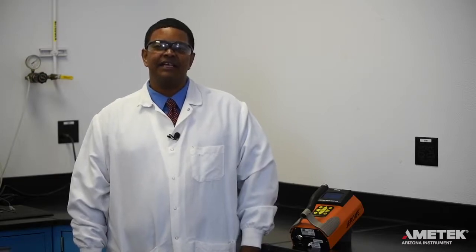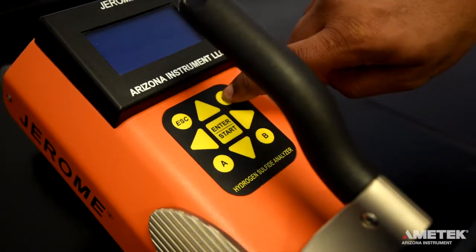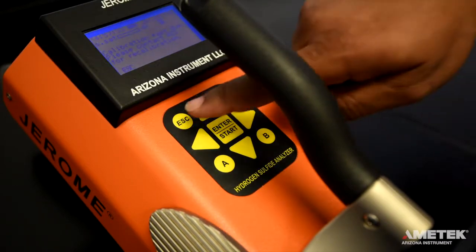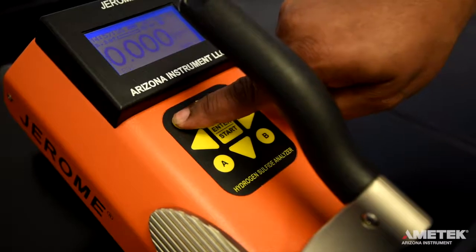After you have verified that you've received everything on your packing slip, simply turn on the instrument by pressing the power button. If any calibration reminders appear, simply press ESC to return to the main screen.